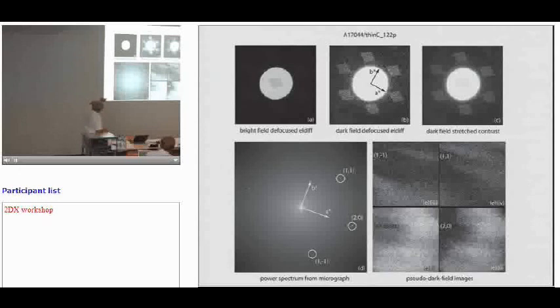You then take an image of this and calculate the Fourier transform, and here are the spots from the Fourier transform, the same indices, roughly the same orientation. You can cut out those spots in the Fourier transform, back transform it, and find out where the power in the image for one spot came from, because it's so strong. So it's kind of like the cross-correlation map in the unbending. But what you see, and this is sort of a typical image on ordinary carbon film, is it's not beautifully homogeneous over the whole image. There's good bits and there's really bad bits. And for one spot, the good bits and the bad bits are different from another spot.